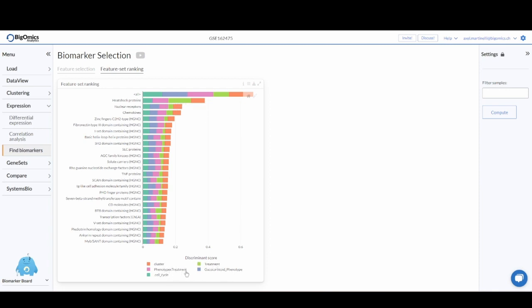You can also see that they are quite prominent for cluster and cell cycles, but we can ignore these two phenotypes as they are automatically generated by the platform.